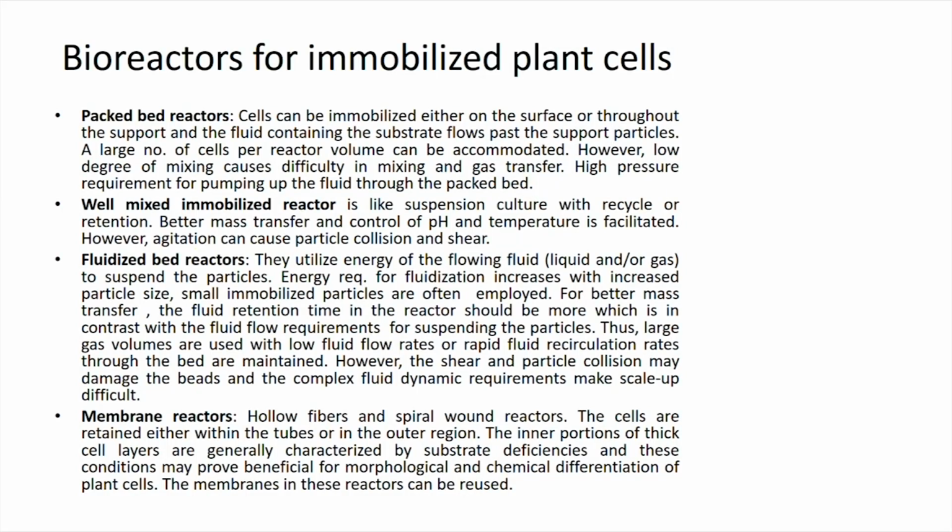So, that is one way of improving the mass transfer of oxygen in these reactors. But then what is the limitation? You have high gas velocities with liquid circulation currents, so the limitation can be the high amount of shear which may get generated.